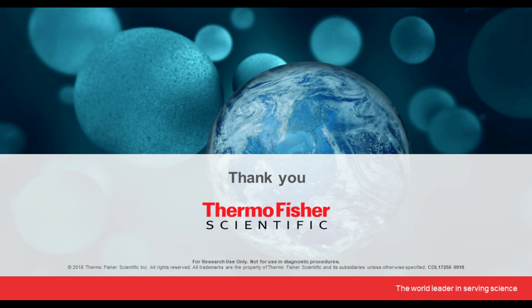Thank you. Do the mass spec assay kits work with tissue and mouse xenograft samples? Yes. I haven't shown any data on those, but we have used these same assays on normal as well as tumor tissue lysate as well as mouse xenograft samples, and we were able to identify a lot of these targets from the cancer or tumor tissue lysate as well as most of the targets in mouse xenograft samples. Does it require a different lysate preparation?